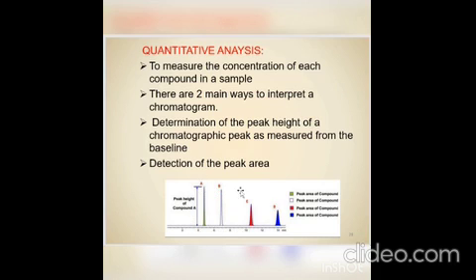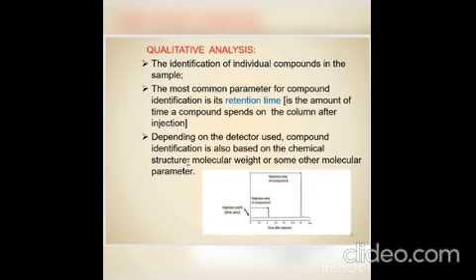The next is qualitative analysis. Qualitative analysis means mainly we are going to identify the compound. Identification is based upon the retention time. Every compound has a different retention time. Depending upon the retention time, we identify the sample.